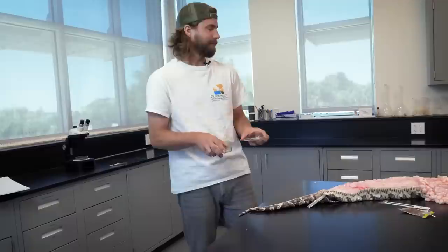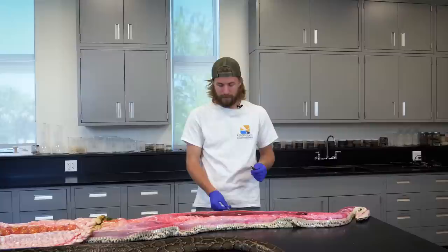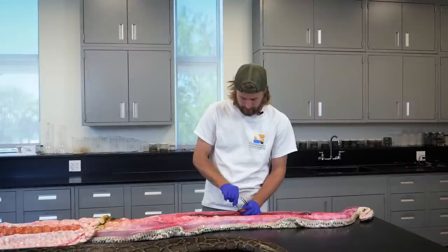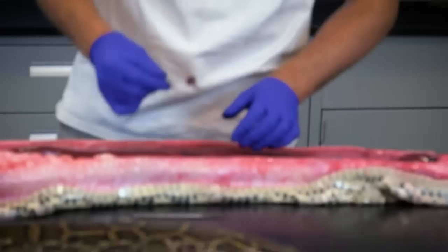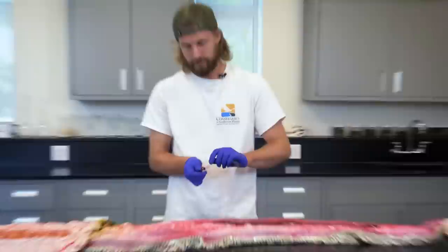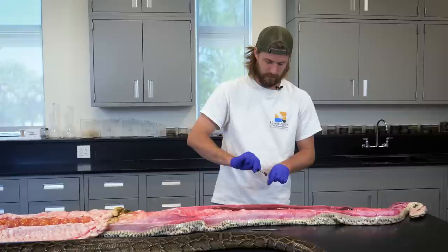The last thing we're going to do is take a genetic sample from the liver — cut a little piece off, put it in this vial, and send it off to another lab to see what information we can get from it. Thanks so much for watching. I hope you learned a lot about Burmese pythons and snakes in general. If you'd like to learn more, you can come visit the Conservancy Nature Center or go to our website to learn more about our research and removal project.